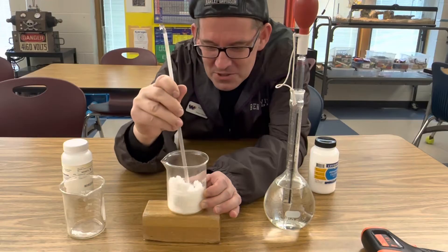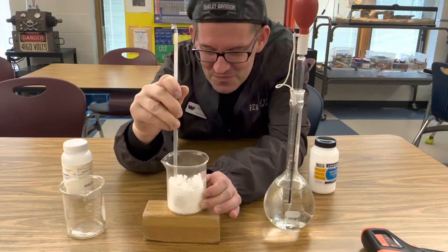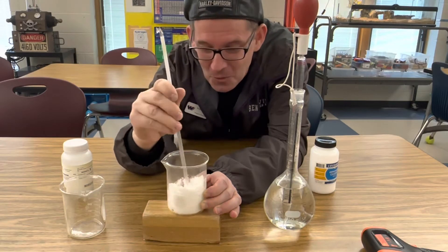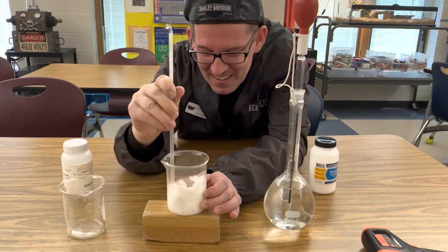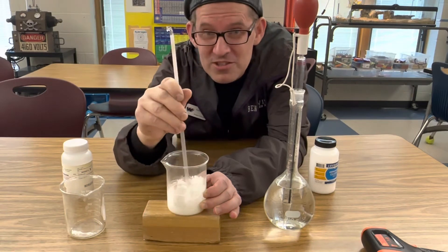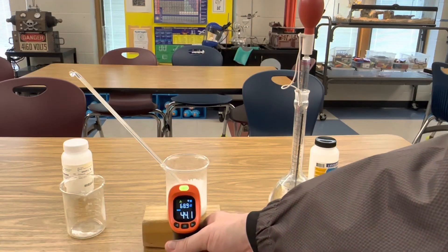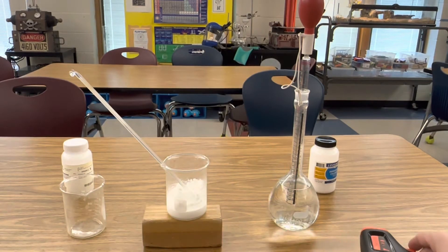As I stir it, we're going to take the temperature and see how much colder it gets during this reaction. Remember, we started at around 70 degrees Fahrenheit. I can already feel the beaker getting cold. My mixture is starting to turn into a liquid, and you can see that it is already down to 44 degrees Fahrenheit. So we're going to keep mixing it.